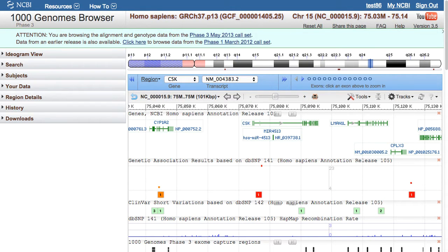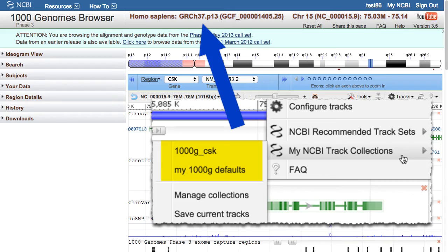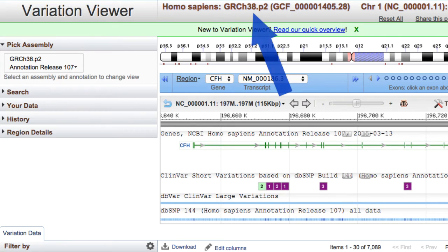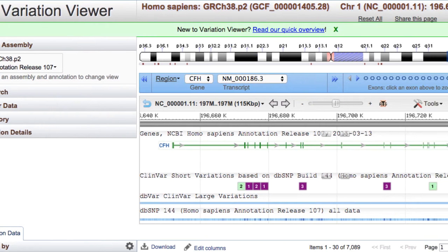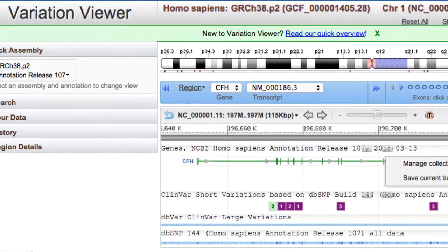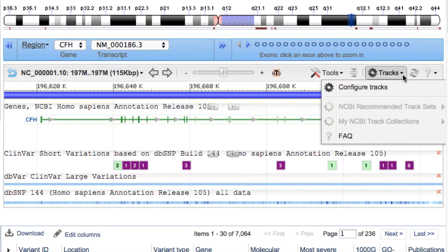Track collections can be loaded into other NCBI genome browsers. Be aware, though, that within a given resource, the Track Collections menu will list only the track collections relevant to the displayed sequence or assembly. For example, my 1000 Genomes track collections were created for the GRCh37 assembly, the only one currently available in the 1000 Genomes browser. So if I go to the Variation Viewer, by default it displays GRCh38, and my 1000 Genomes track collections are absent. However, when I change to the GRCh37 assembly, they show up.